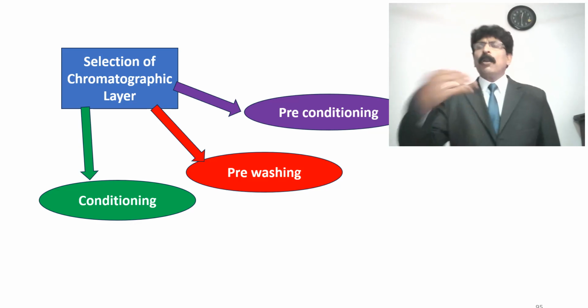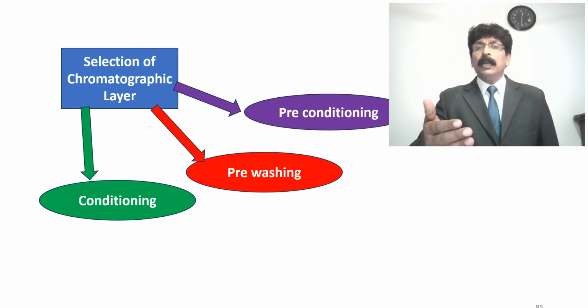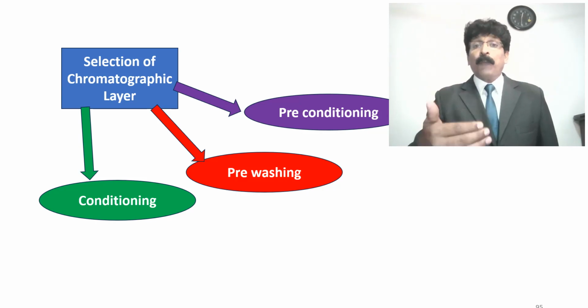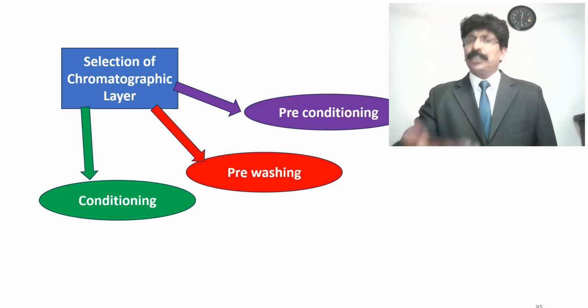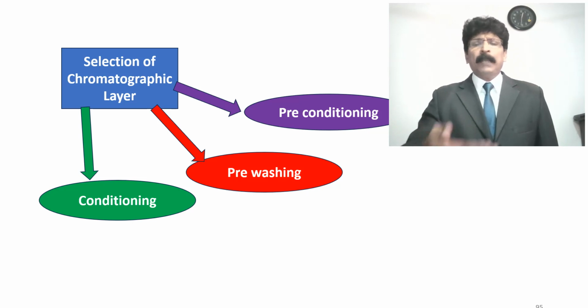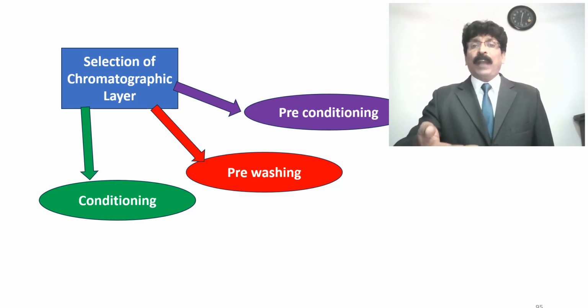When comparing normal thin layer chromatography and HPTLC, we are performing a more sophisticated, more minute analytical technique. So we have to perform preconditioning of the plates or of the experiment with saturation in the developing chamber, and pre-washing using methanol. If there is any debris, impurities or dust present in the stationary phase thin layer, it can be removed by the methanol solvent, a highly polar solvent. And then you can go for conditioning the plate which is ready for your experiment by activating it using the hot air oven at a temperature of 105 degrees centigrade for 30 minutes.